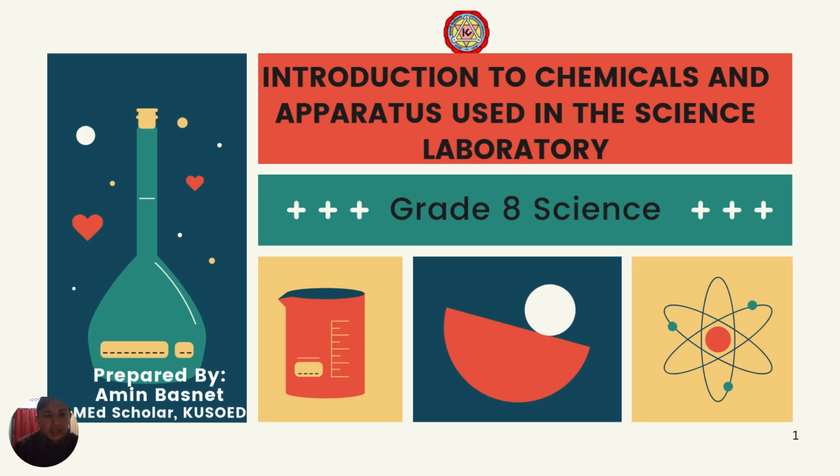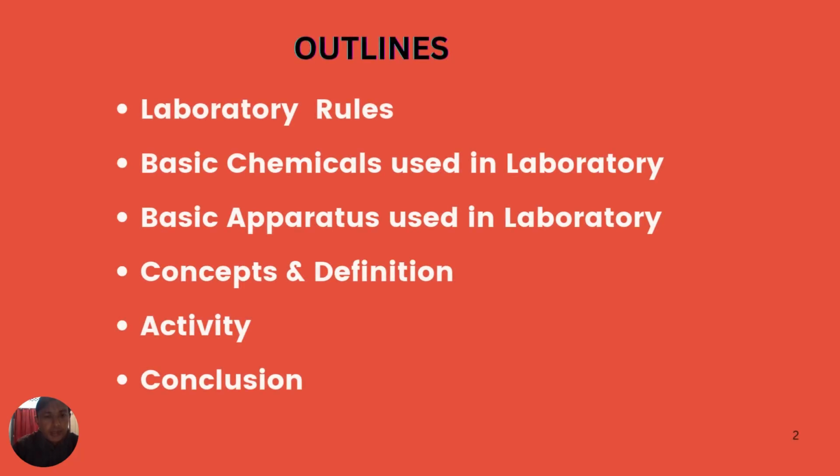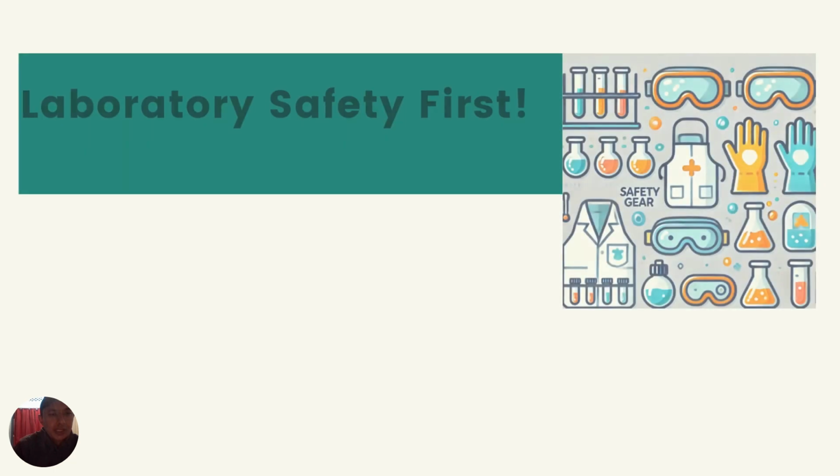Now let's start with our agenda. Our agenda is introduction to chemicals and apparatus used in the science laboratory. As we move to the next slide, we have today's discussion matter: laboratory rules, basic chemicals used in laboratory, basic apparatus used in laboratory, concepts and definitions, activity and conclusion.